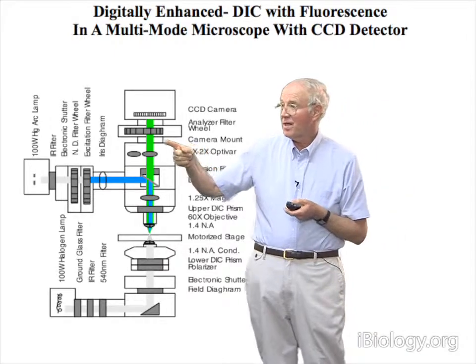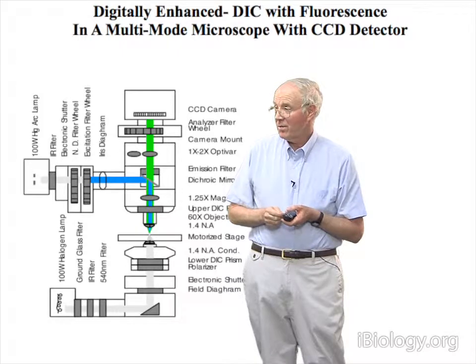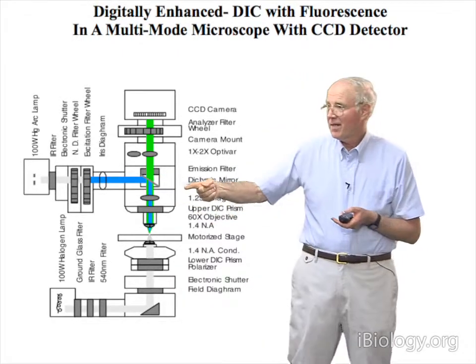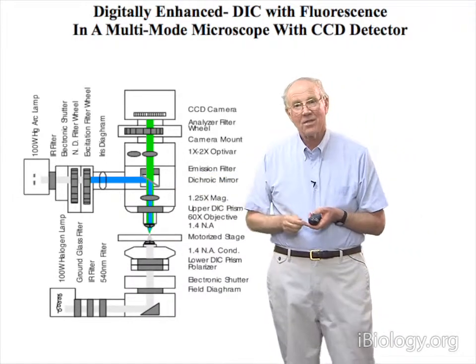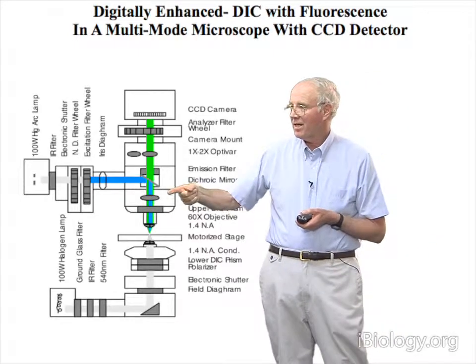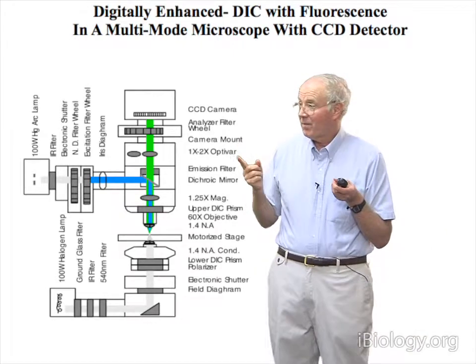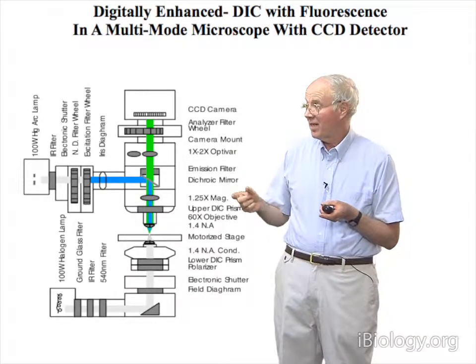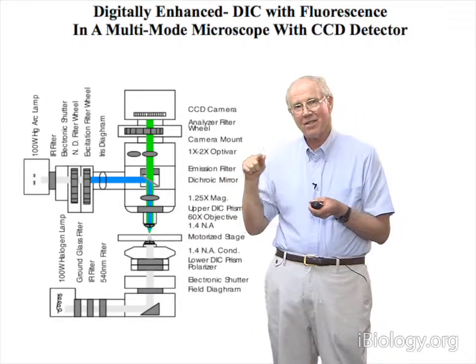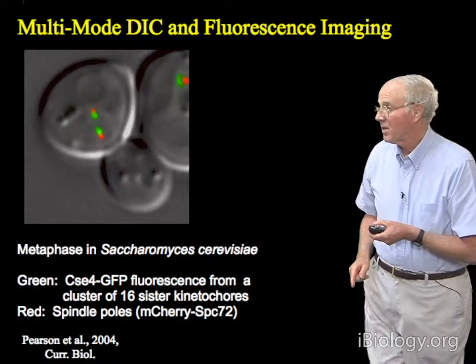And so you have to rotate that out of the light path. In the beginning, we did that by rotating the filter wheel. The manufacturers now have rotatable nose pieces, so you can put the analyzer in one of the slots instead of a filter tube, for example. And some of the manufacturers actually have an analyzer that goes in at just the right place, with a little motor on it that can either push the analyzer in or take the analyzer out, so your computer can control whether it is or isn't in the light path. Right? We get to my last slide.